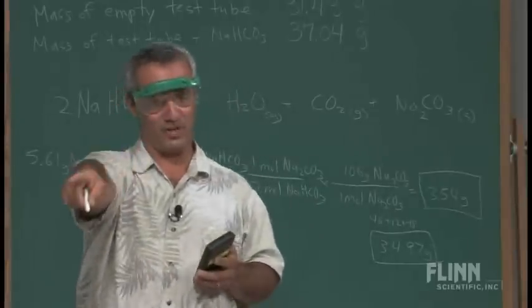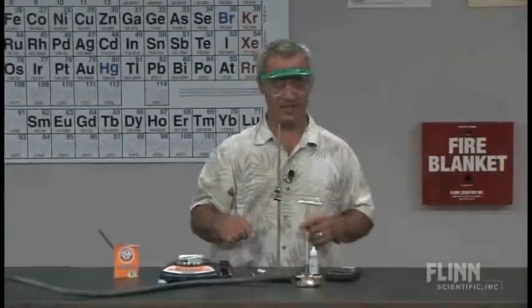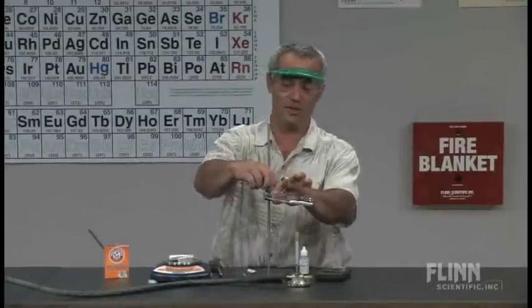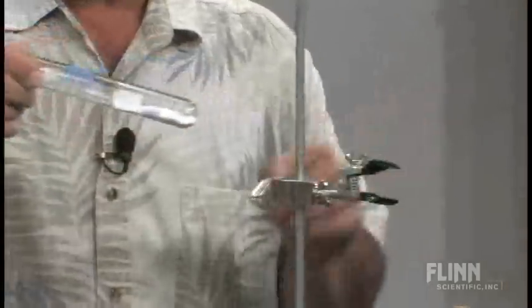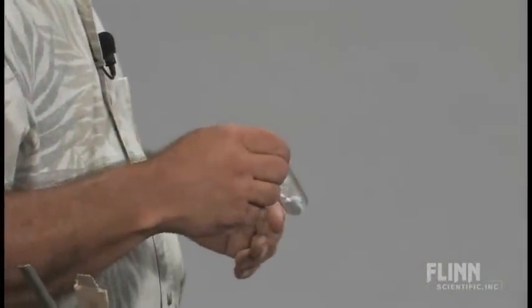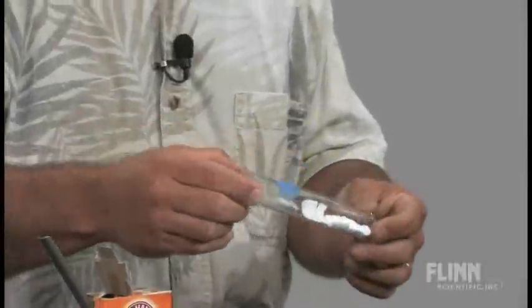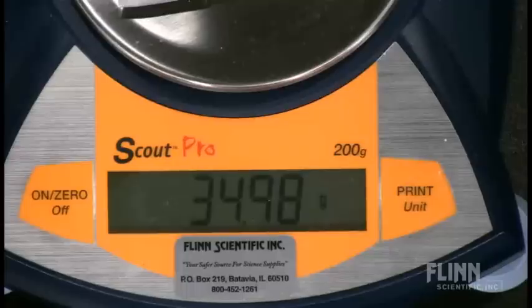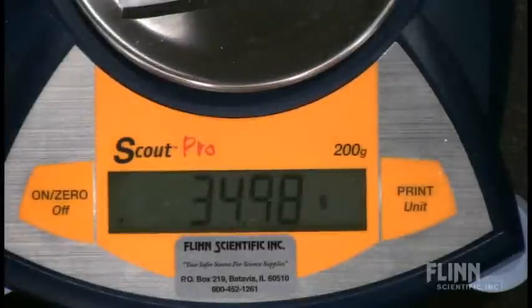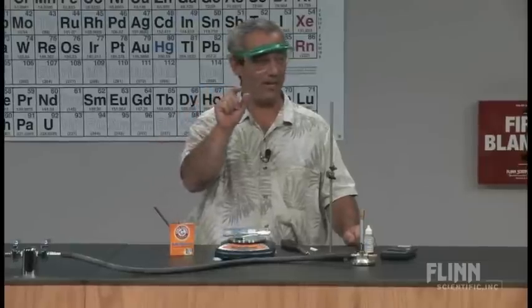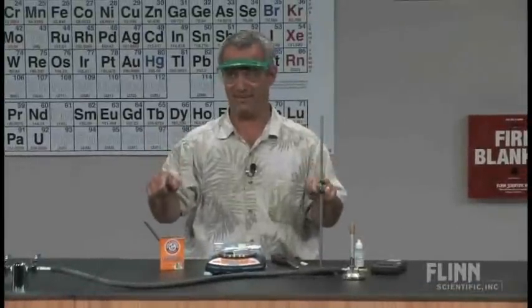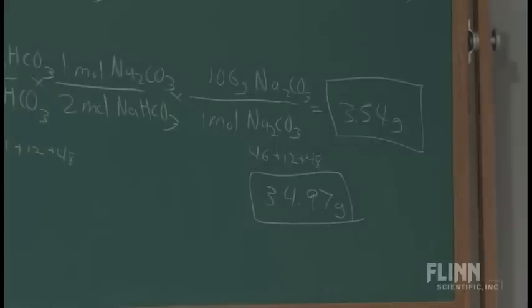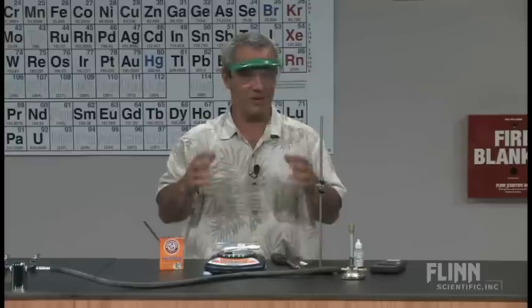This is cooled down by now, cool enough to take this off. The balance still zeroed nicely, didn't wander at all. So let's see how close I am here. I'm a little nervous, I have to say. But, 34.98 grams. And I give them a leeway of .03 grams on their side. So I'd be giving myself a high five right there. And literally, they do that during this type of lab. When that happens, they're predicting 34.97, they hit 34.98, 99, they're right on the money.